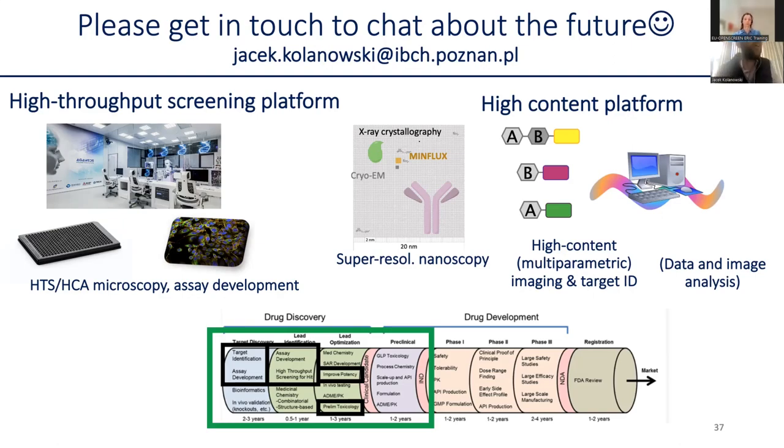So we have done this, and you are right, this is quite a common approach for viruses, for example. We've done that work before here at the institute, where we had a virus which was not dangerous, but was bioluminescently labeled, and then we could study the entering of the cells by the virus and blocking that entry. Of course, the modification of fungi and creating bioluminescent fungi is also possible. We just have to remember that some fungi have intrinsic bioluminescent systems in them.